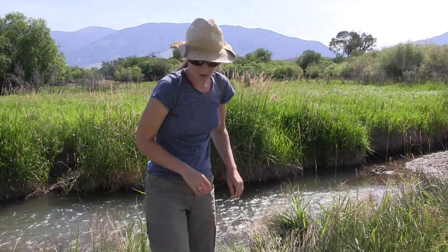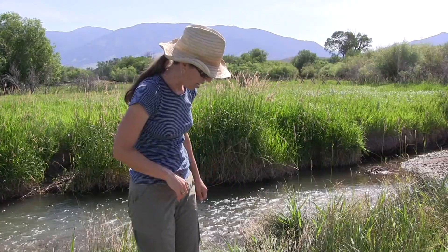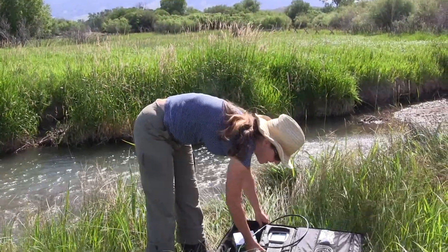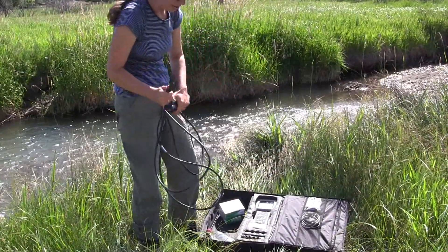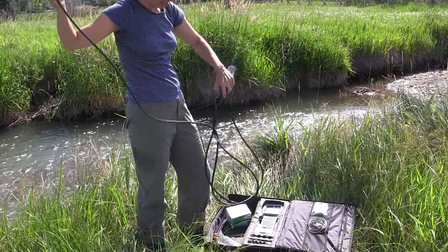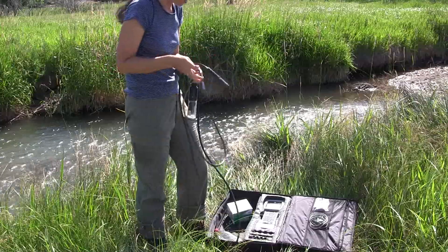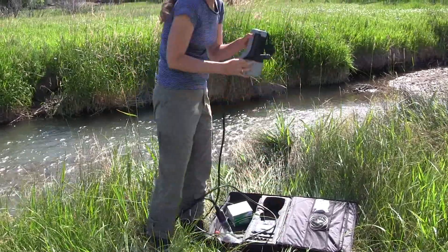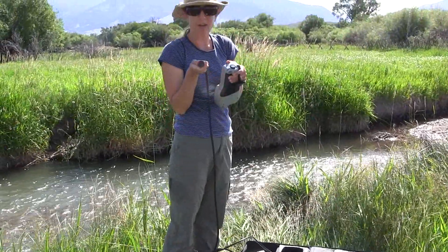While that's happening, you can take your water-based field parameters using the YSI meter. It comes packed in a case, and the first thing you need to do is attach the probe to the meter part. It will be calibrated for you before your site visits start for the day.